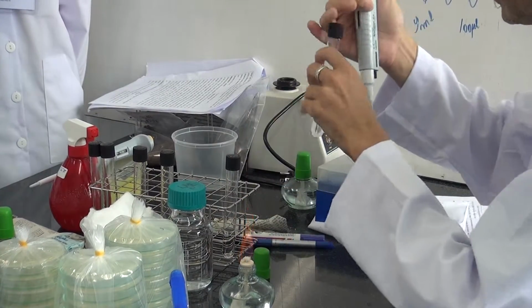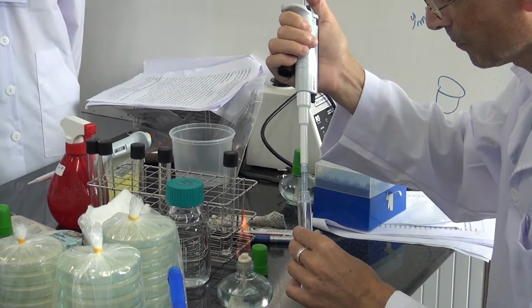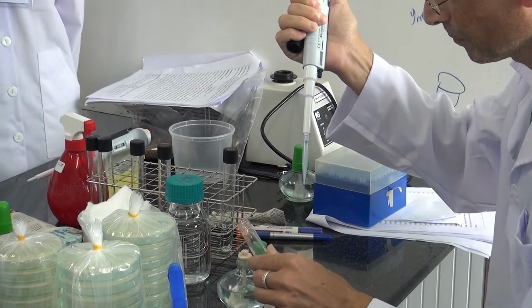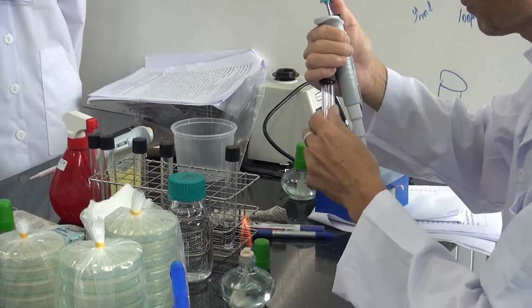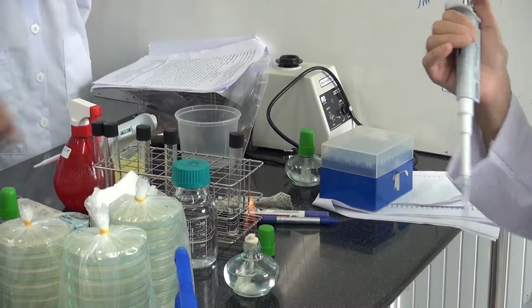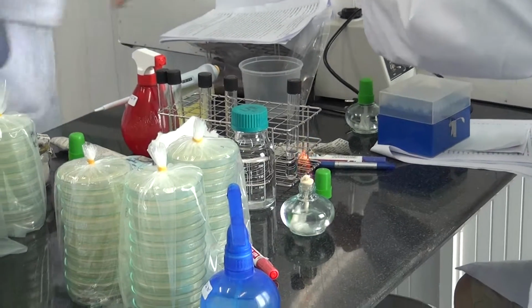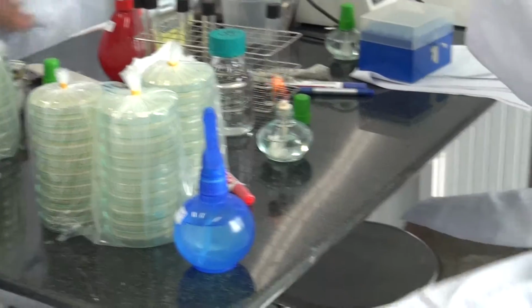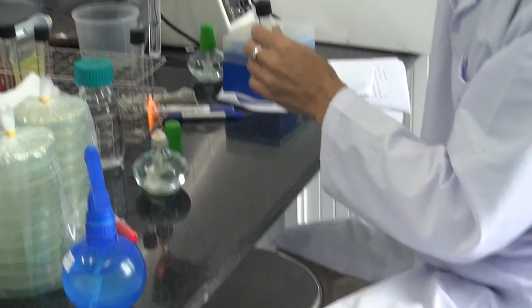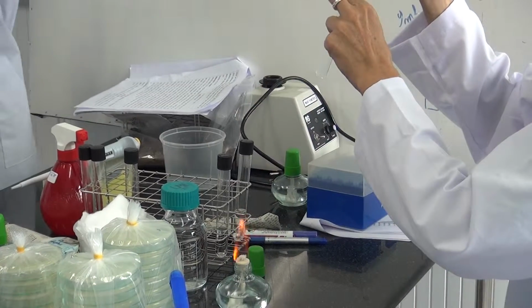And also, okay, now this you will vortex. It's here. Yeah, when it's plugged, so it will move. And then you will go on. As you go from this one to this one, you change the tip.